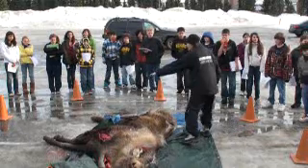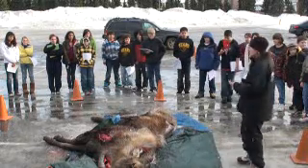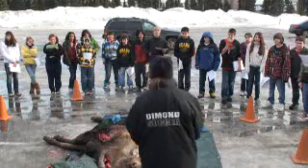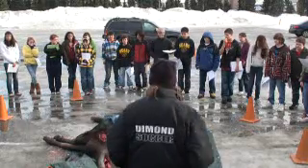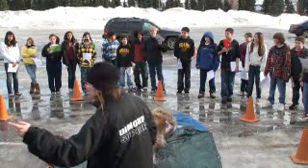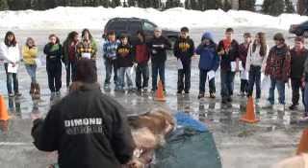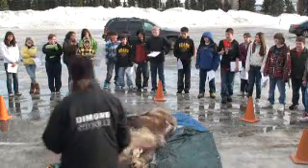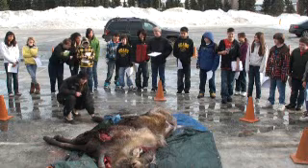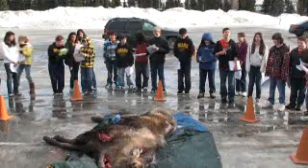Back here at the bottom, you can see the hooves. The hooves are special in that they're also an identifying characteristic of the family that the moose belongs to, which is Cervidae. Can anybody see what's special about the hooves? They tilt. They're dark colored. They have two different segments. They have two toes. Do you see how they're split here? Their hooves are split down the middle. They have two toes, and that is a unique characteristic to the family that the moose belongs in.